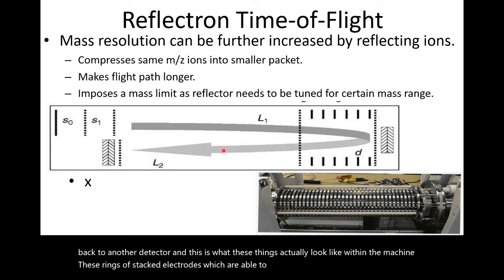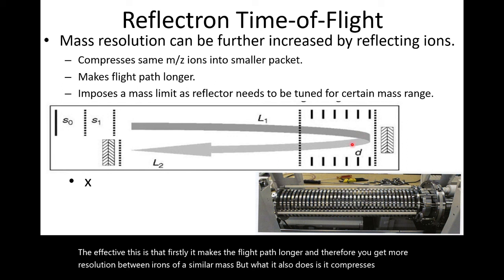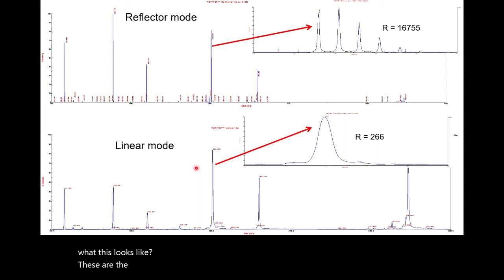The effect of this is that firstly, it makes the flight path longer, and therefore you get more resolution between ions of a similar mass. But what it also does is compress the ion packet of the same mass into a smaller piece of space, which increases the resolution. So what this looks like, these are the same mixture of peptides. In linear mode, you get these wide peaks where you cannot see the isotopes.